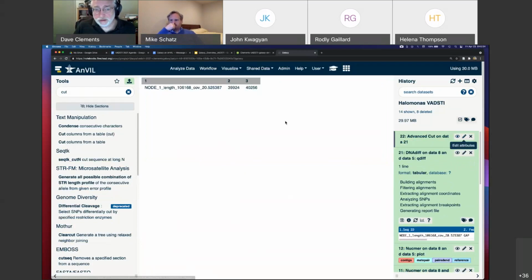And I poke it in the eye to see it, and it looks like I got what I wanted. I got the name, I got the start, I got the stop. Okay. And so I do have a 3-column data set, and so I can run bed tools, except I can't. And this is because of the fundamental question in bioinformatics, and I am sorry to say this. And that question is, should we start counting at 0 or should we start counting at 1? And there are actually good reasons for this debate, but most of the time it's just tedious. And it turns out that DNA diff counts starting at 1, and bed format and bed tools, therefore, starts counting at 0.